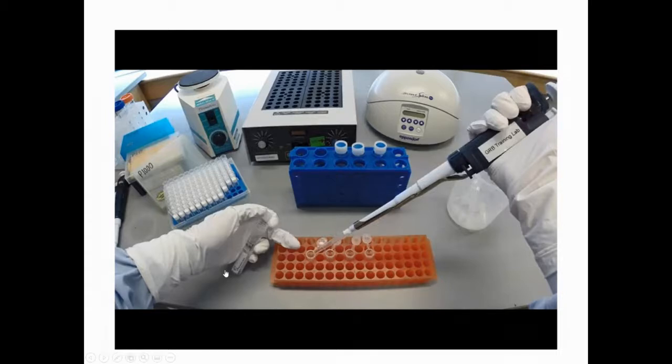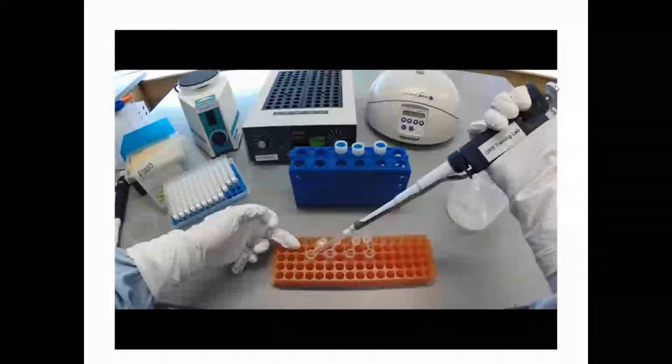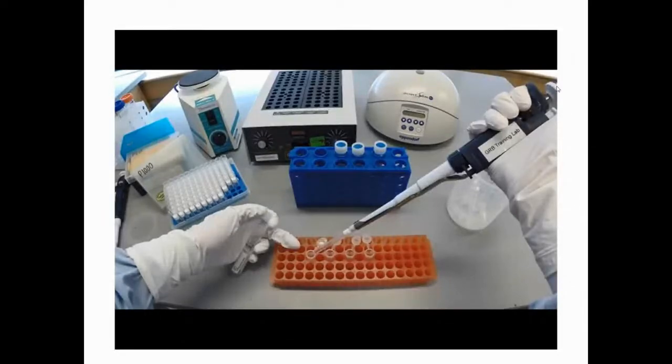So when you use a pipette, it's always very important to have the tip in place, and then you depress the plunger to the first stop, which is a very gentle, soft stop, and then you insert the tip into the solution and slowly release the plunger. In the meantime, the pipette tip will draw the solution into the tip.